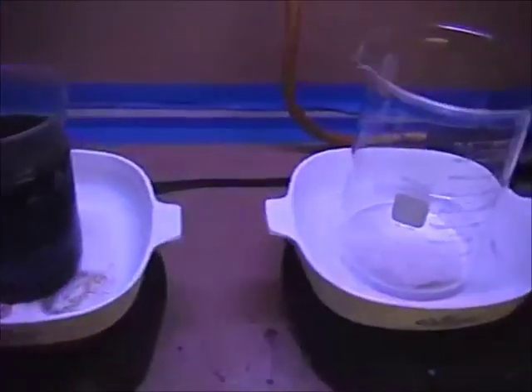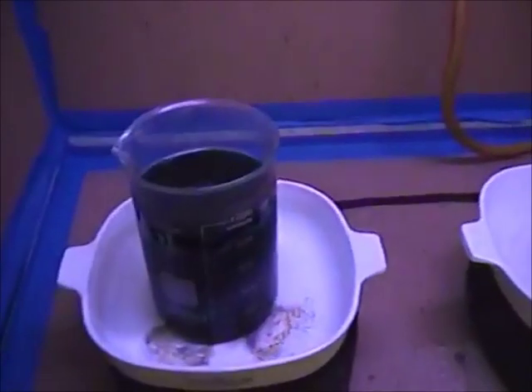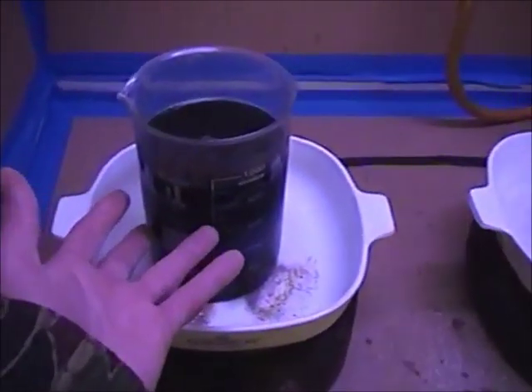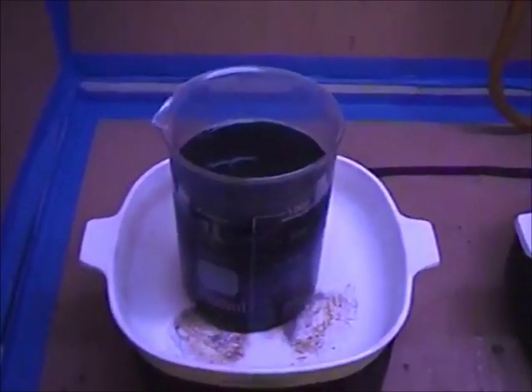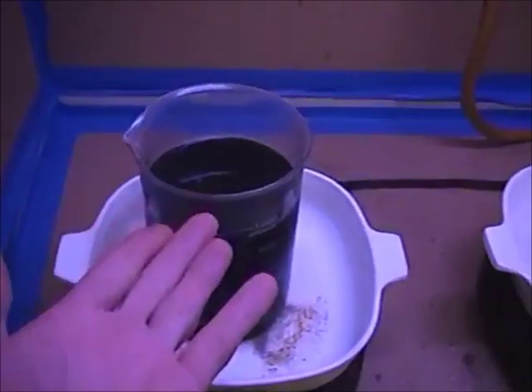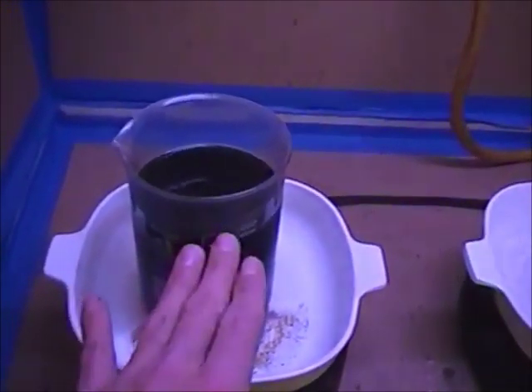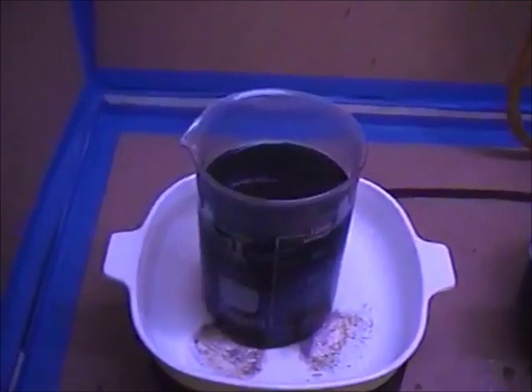So what I've done over here is set up a 2,000 milliliter beaker. Once I warm this up, I'm going to warm it up to room temperature, because if I get it real hot, of course I could get all these metals to go back into solution. But then whenever it cools off, all the metals are going to precipitate out. So what we're trying to do here is add sodium hydroxide to precipitate out any metals as a hydroxide. There's already some trash in the bottom, so it's not going to matter if we add a little bit more, because we're going to filter in the next step.